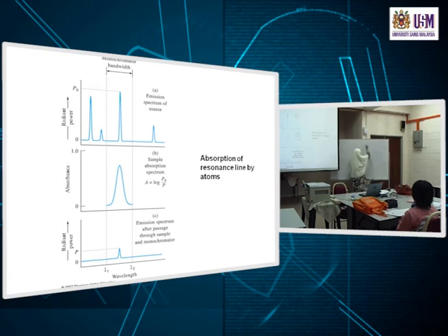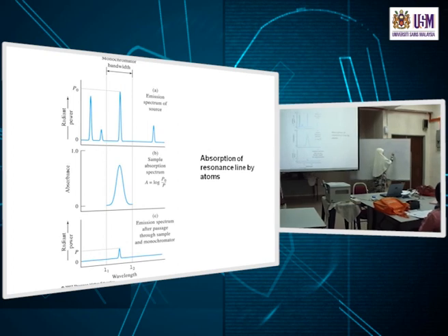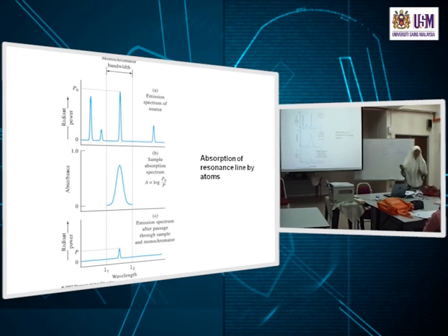Let's get that right: spectrum, continuum source. So if in AAS we use a continuous source, and we use a monochromator, the light coming out will be white, using the slit width, and will fill this monochromator. If we use a line source, we only get lines coming out, not light over the whole range of the monochromator bandwidth. So this is from the source.